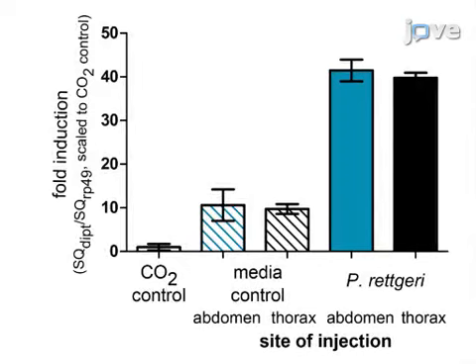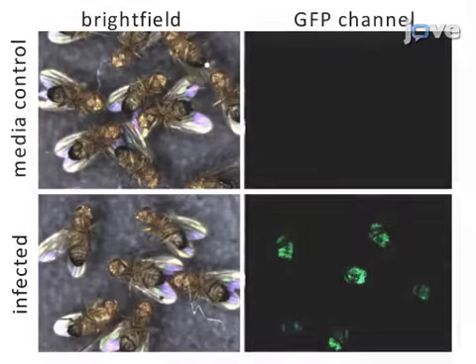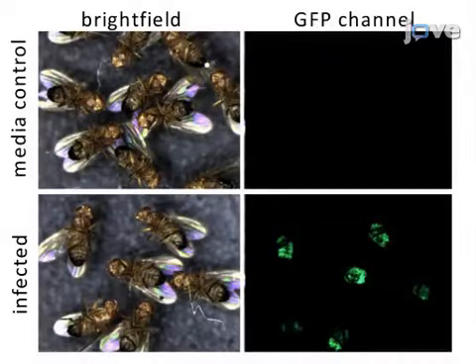Ultimately, quantification and characterization of bacterial infection in Drosophila melanogaster can be used to test how genetic and environmental factors alter immune competence of the fly. This method can be used to address key questions in the field of insect immunity, such as how host genetic and environmental factors influence immune capability, or how distinct bacteria vary in their infection kinetics.